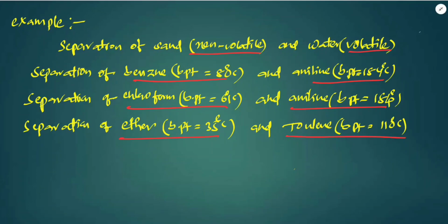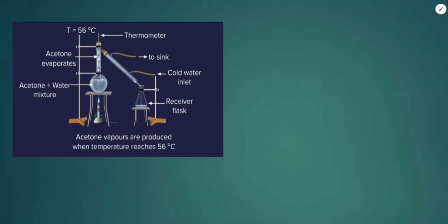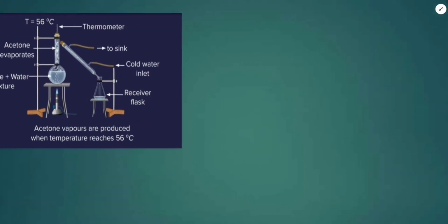Have a look at the experiment for simple distillation: the distillation of an acetone and water mixture. In a round bottom flask we are taking acetone and water.